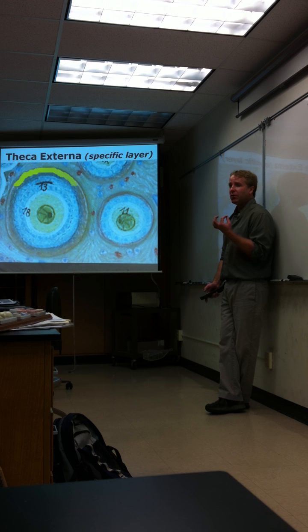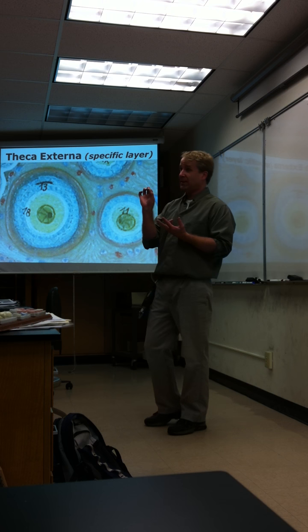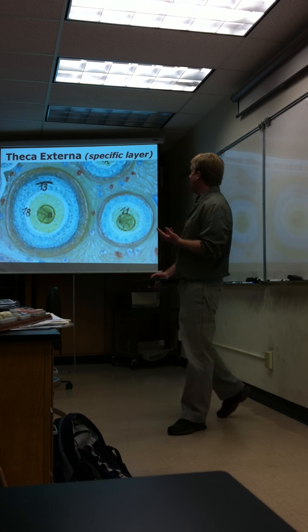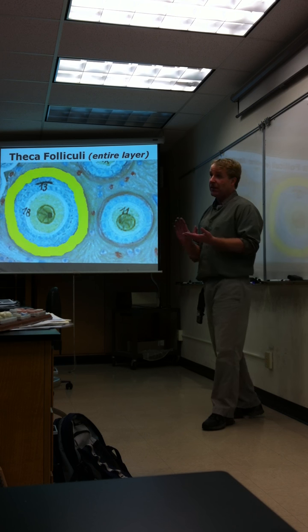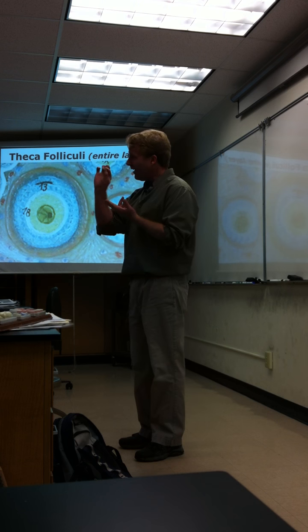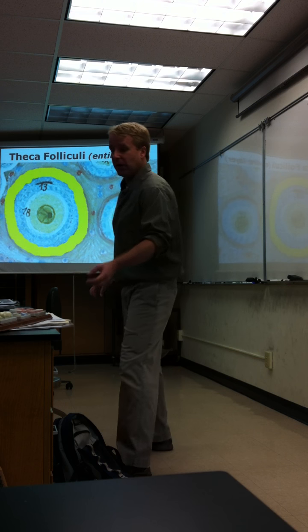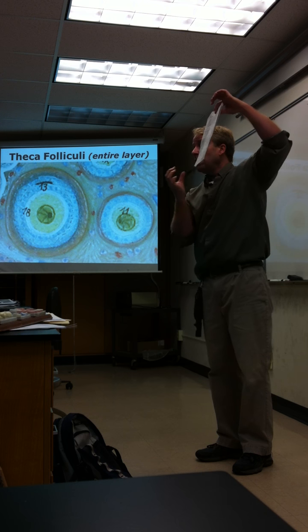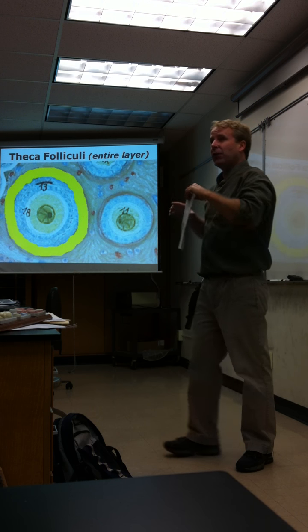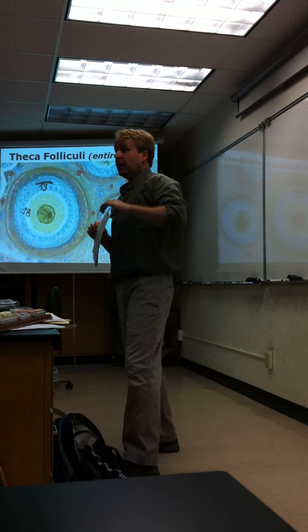You have those in your list for looking in the microscope. Because the theca interna and externa are hard to differentiate in the microscope, I'll just accept either for the theca folliculi. That's easier to remember. Together they make the theca folliculi. So when you see theca interna and theca externa on the list, you can lump them together and say theca folliculi. I've already labeled my picture that way, so you can do that too.